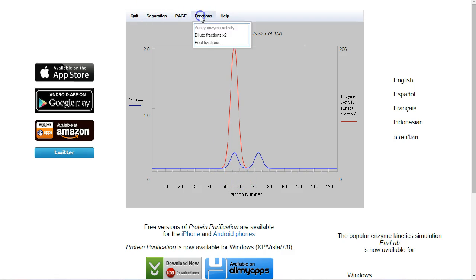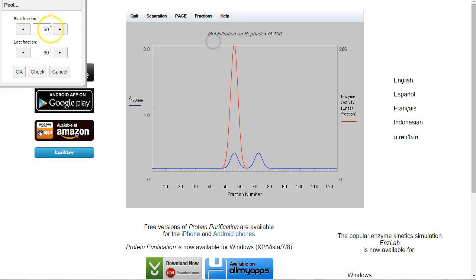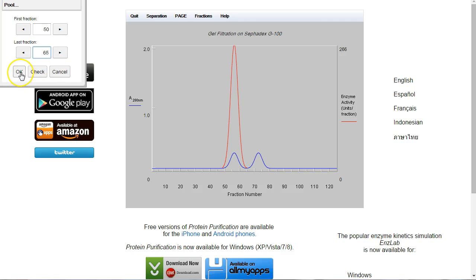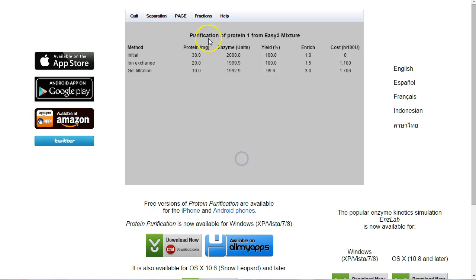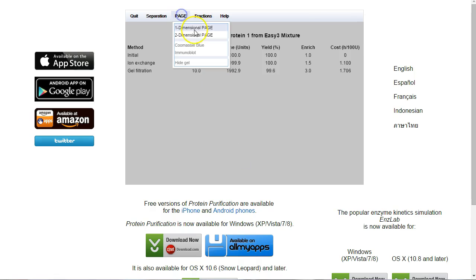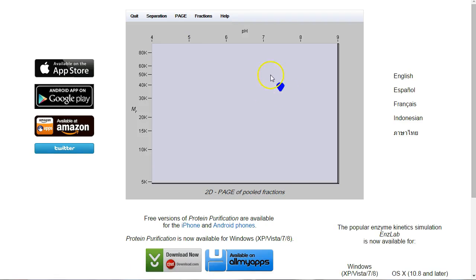I'm going to go to fractions, pool fractions. We want everything from 50 to 65. OK that. Now you can see we've got a yield of nearly 100%. And if we have a look at our gel now, you'll see that we have a single peak. So we've managed to purify out our protein.